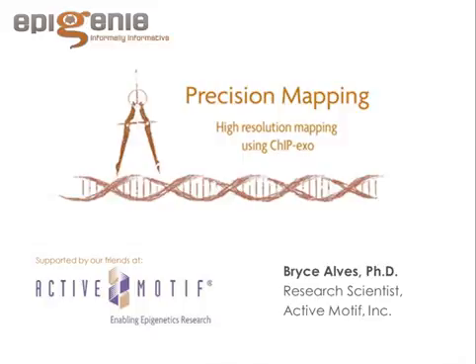Do you think ChIP-Exo would be adequate for detecting a different histone modification? That's a very interesting question, and this is actually what our collaborators at UCLA in the Alexander Hoffmann lab have started to do with ChIP-Exo. I haven't heard the results from their studies yet, but they were so thrilled with how our data looked when looking at RelA that they have a branch that's looking into histone modifications or phosphorylations and all that on the DNA.